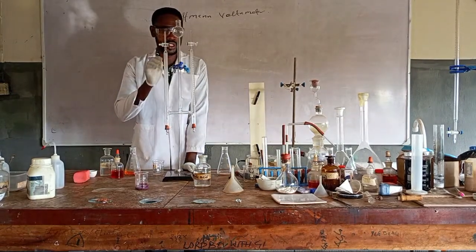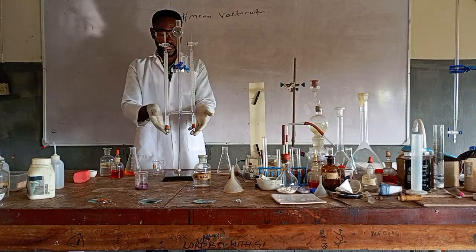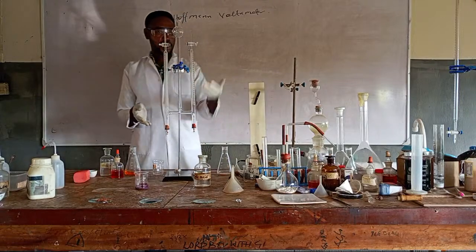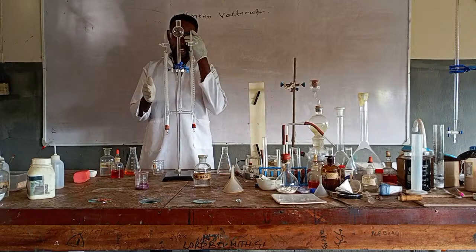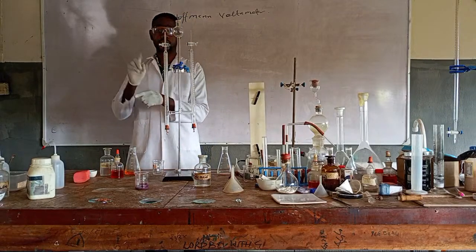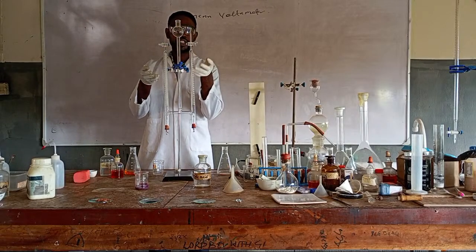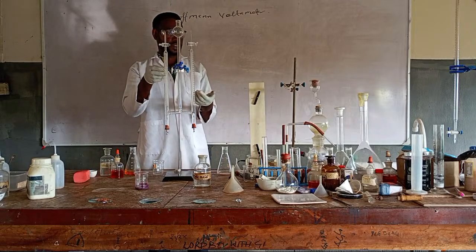What is supposed to happen is that gas will come out here, which is oxygen, or depending on how I connect my source of electricity, hydrogen will come out in one. But water will always contain hydrogen to oxygen in the ratio of 2:1 by volume. So if here is 2 and here is 4, it means this is the side for hydrogen and here is for oxygen.